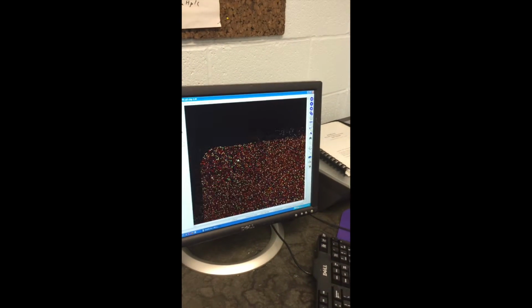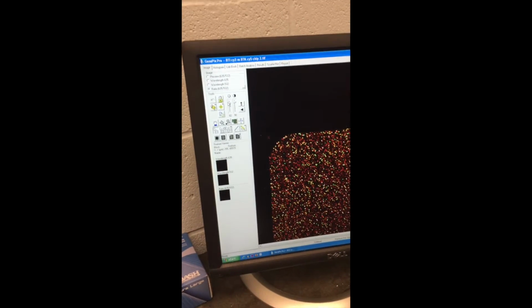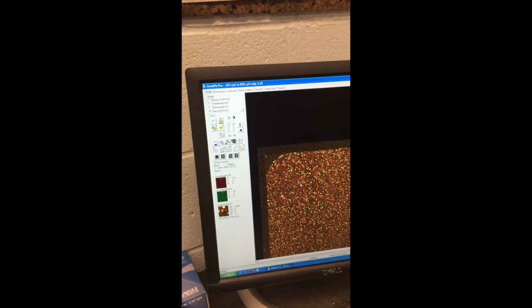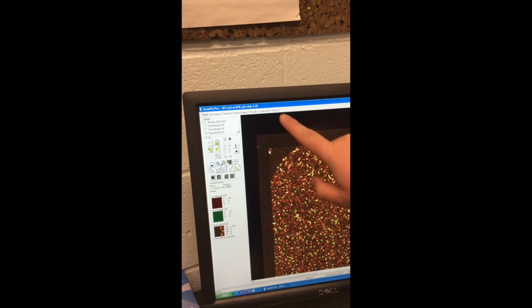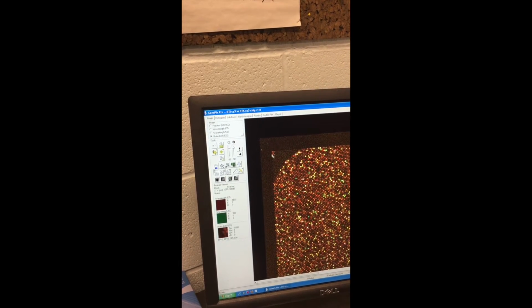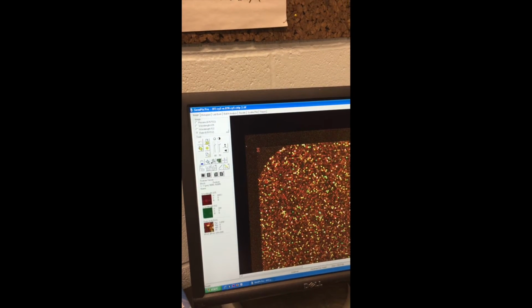Anyway, so here's a really beautiful array, and you can see that on the corners, let me just increase the brightness a little bit, on the corners it has little placements, and this is where it tells us where to put the map. So it's like telling us north and south and things like that. These 5 spots here are, again, just to help us place our map onto this array.